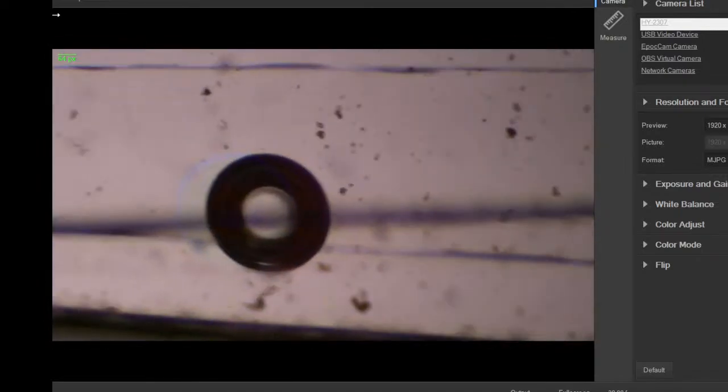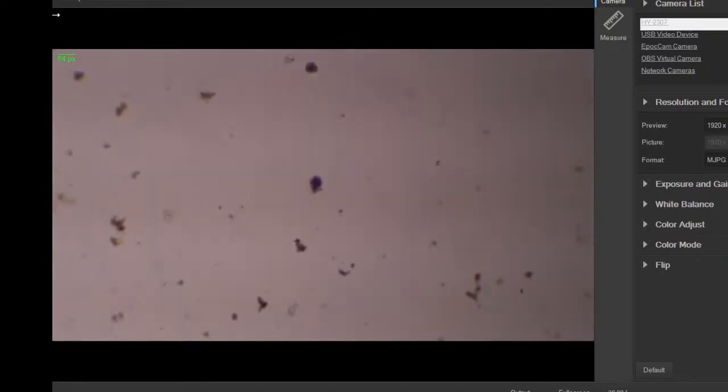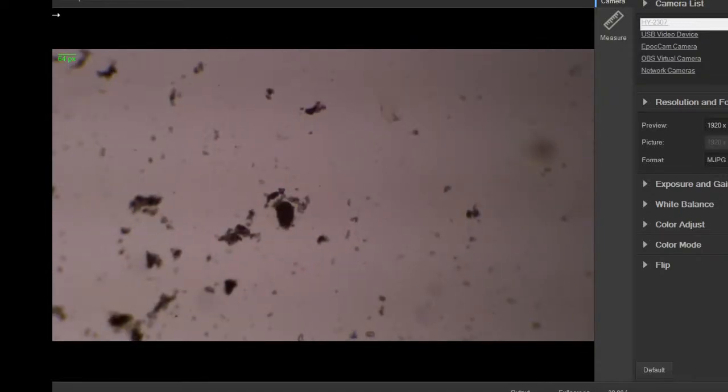That's the problem when you tweak a slide a little bit, stuff gets moved all over the place. I can't find my little buddies.